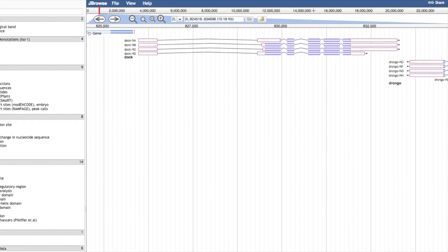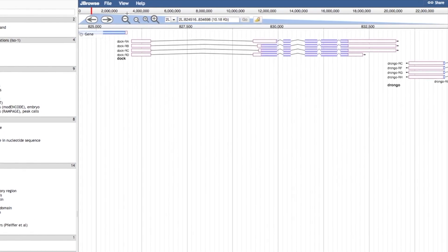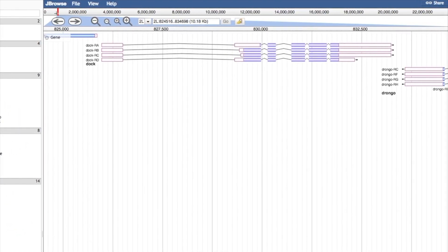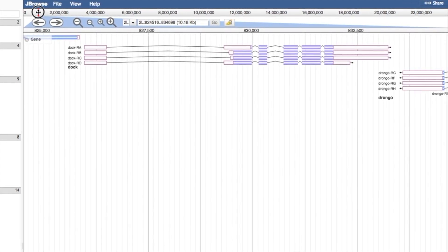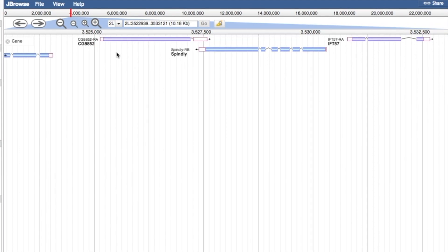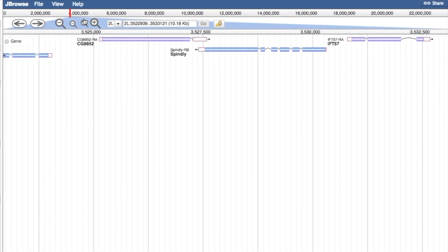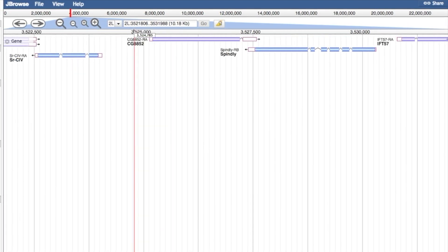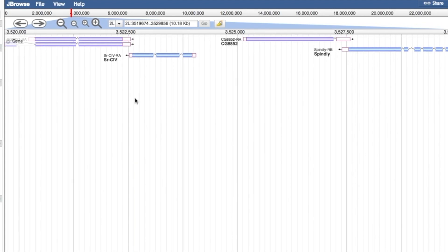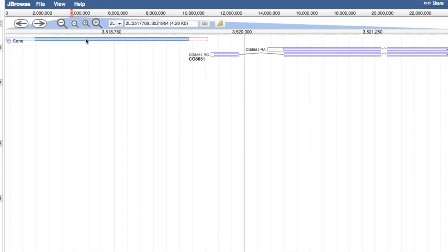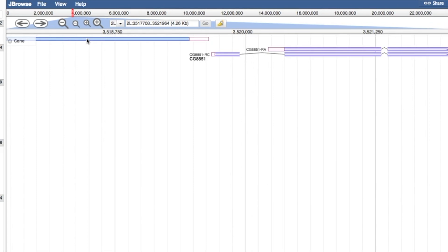At the top, the Coordinate Scale has a slider that can be used to move to different regions. The region of the chromosome currently displayed in the detail panel is indicated with a red box. There are clickable scroll and zoom icons, though you can also click and drag an empty area in the Genome Viewer to pan across the genome. You can use the Coordinate Scale to centre your genome view to where you click, or select a smaller region to zoom to by clicking and dragging along the scale.